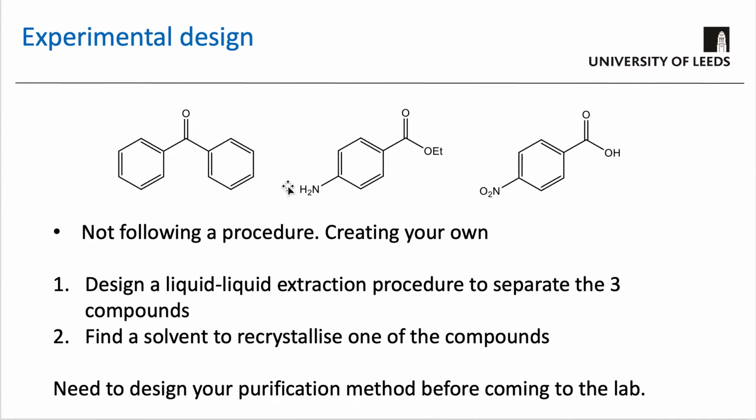You're going to have to try and work out how you can get them to separate out into organic and aqueous layers, and then separate those layers, so then you've got the compounds in different solutions.